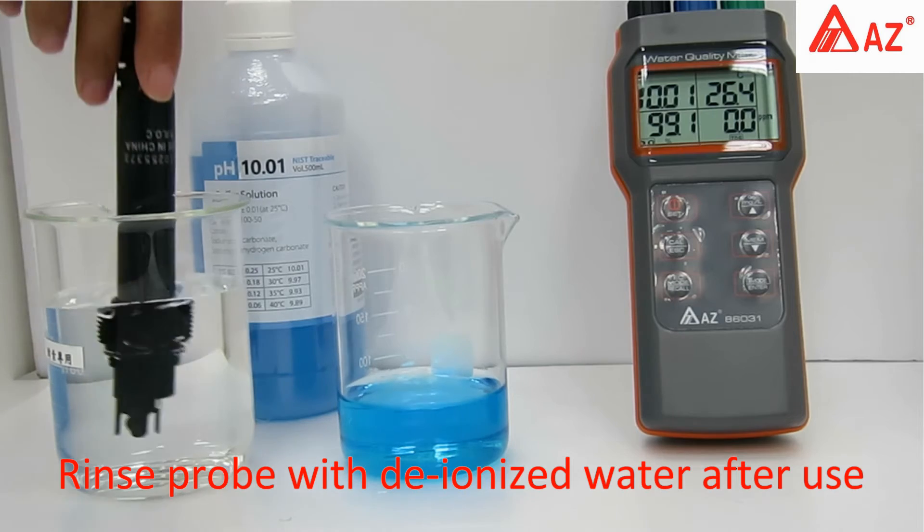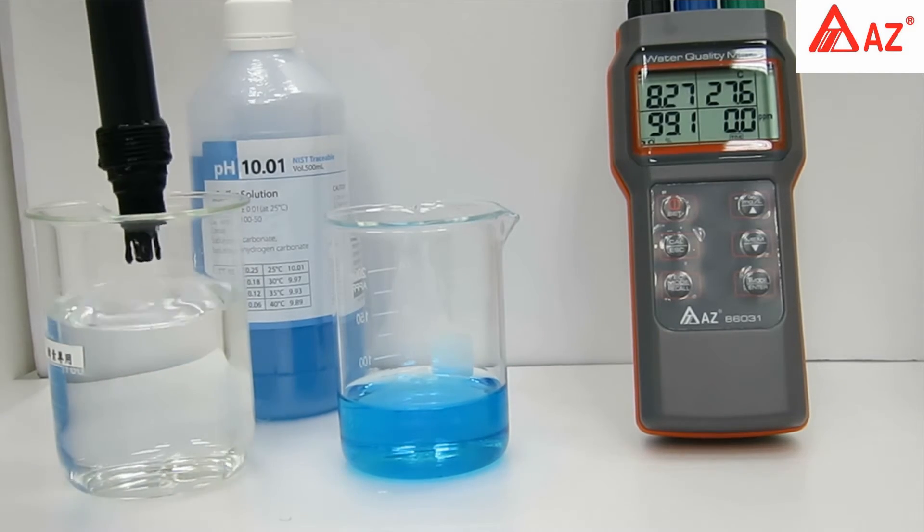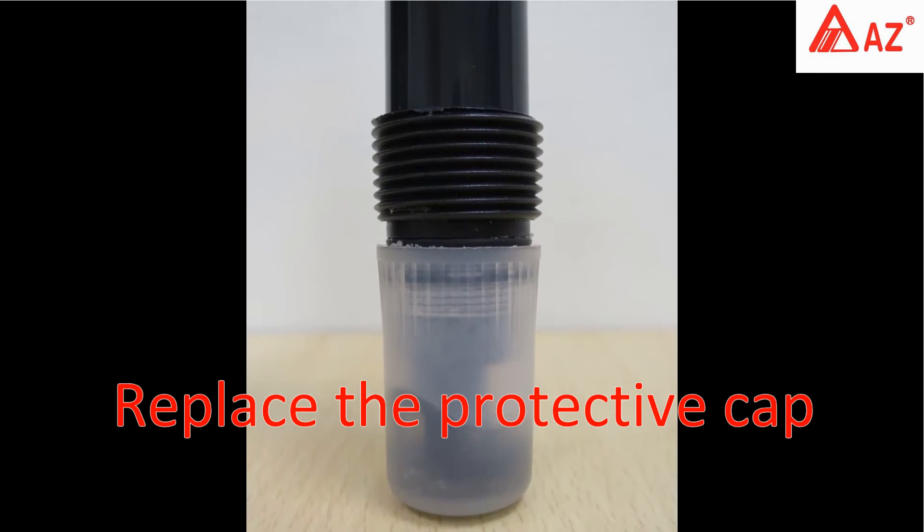Rinse the probe with deionized water when changing solutions or after use. Dry the glass bulb and replace the storage cap.